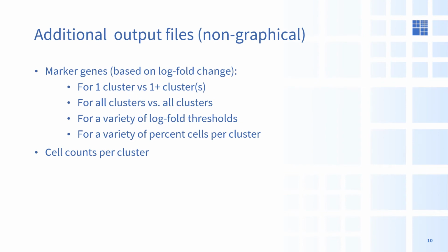And in addition to all these graphical figures that we've seen, there's also a lot of charts and tables that are standard output for single-cell analysis, such as charts of log fold change expression across clusters, whether grouped by metadata features or by just their numerical cluster number, with various cutoffs, and also the cell counts per cluster. So like I said, if you want to get more information on any of these standard figures, there are a lot of tutorials and vignettes for Seurat available on the Seurat website and elsewhere.